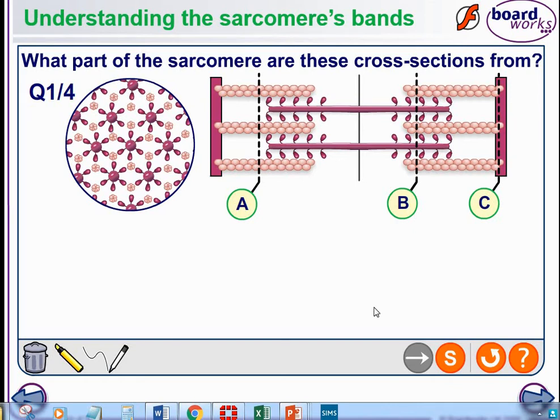Right, let's see what we got. Which part of the section? Hopefully, but I was guessing.